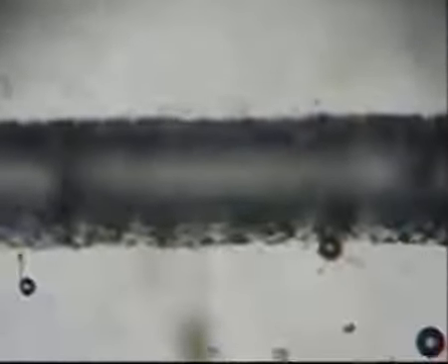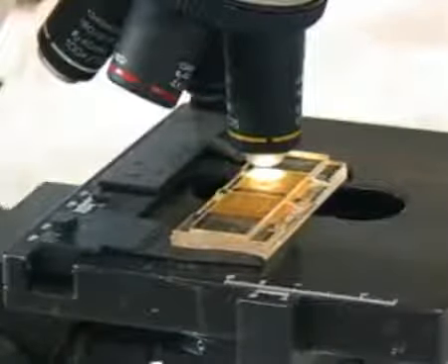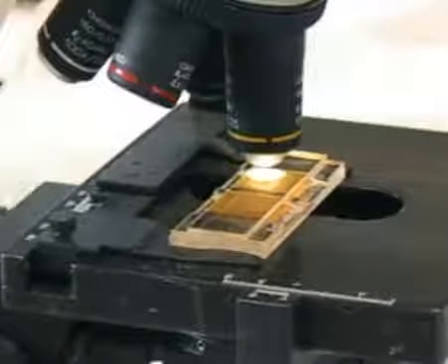Start by focusing the microscope on one of the grid lines, after which you focus on the air bubbles, which are round in appearance and have a black outer ring and a clear center. Now systematically scan all the columns of both the chambers. Eggs that lie outside the chambers are not to be counted.